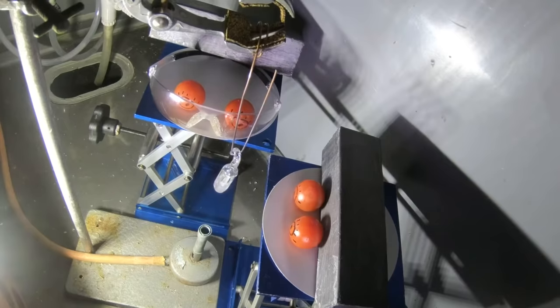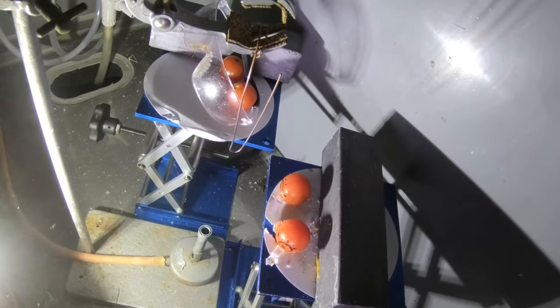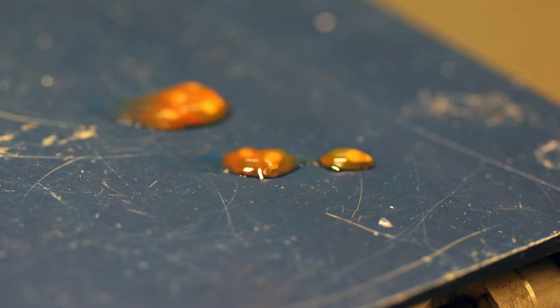The protective effect of the glasses... We call them glasses, though they're actually made of polycarbonate plastic. If you look close up, you can see where the plastic has been pitted by flying bits of glass. The safety glasses are probably not usable again due to the scratches.